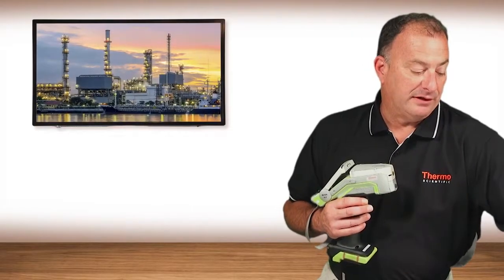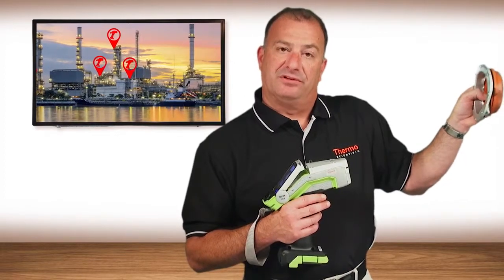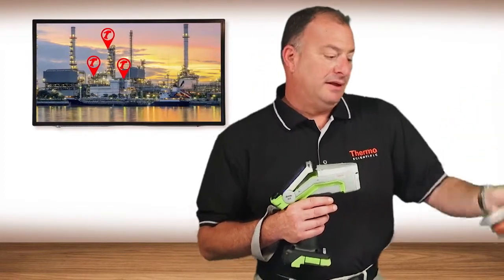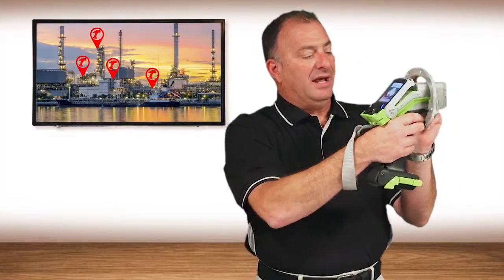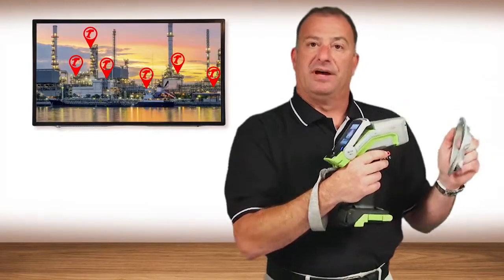It's not unusual to find within a petrochemical setting ports like this. These are non-destructive testing sample ports, and they exist throughout the plant. We now have the ability, unlike in the past, to actually enter into that port to perform the analysis on the piece of pipe that resides on the backside.